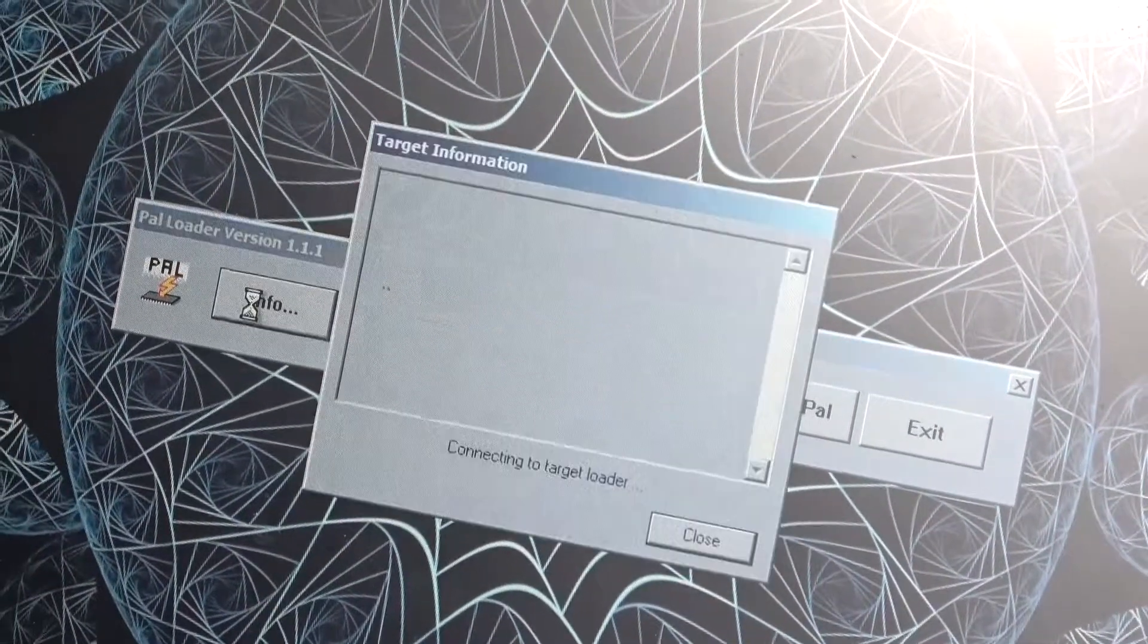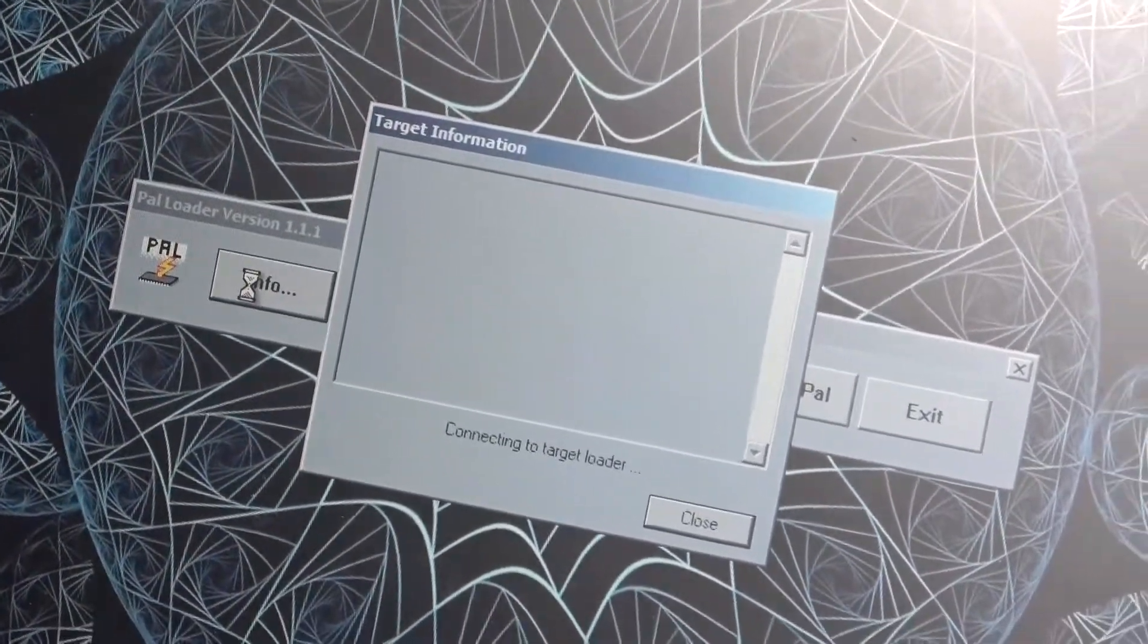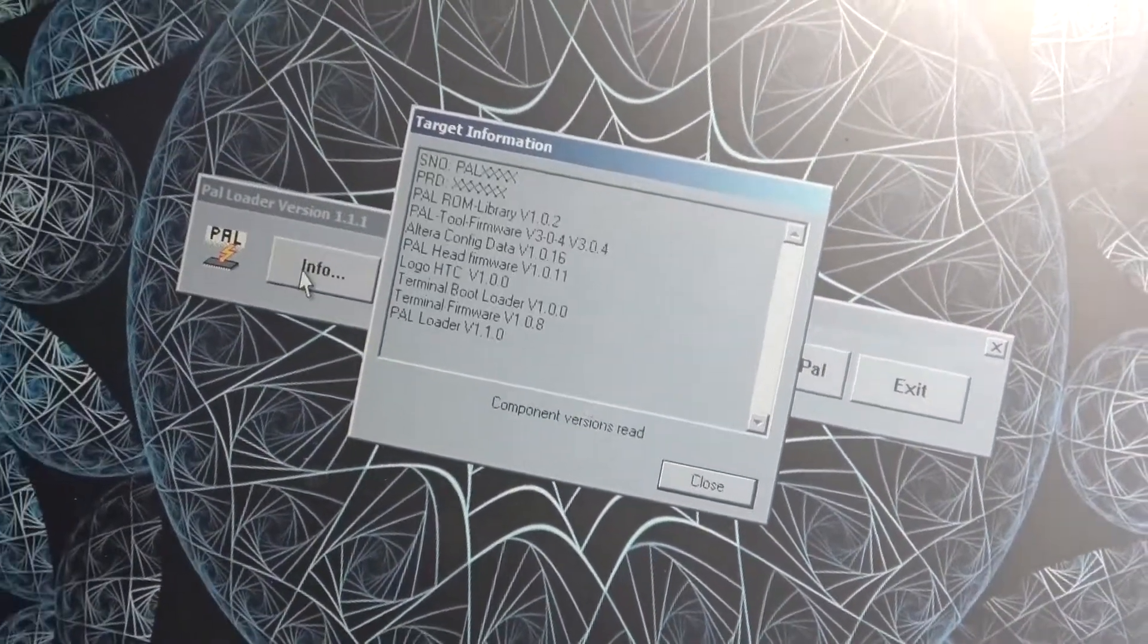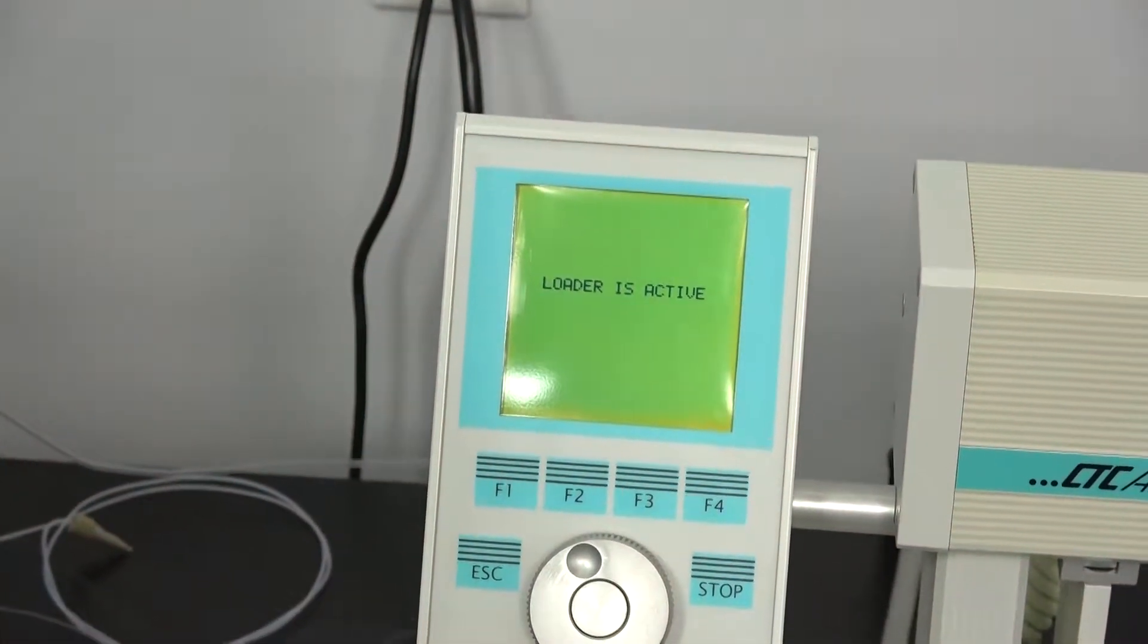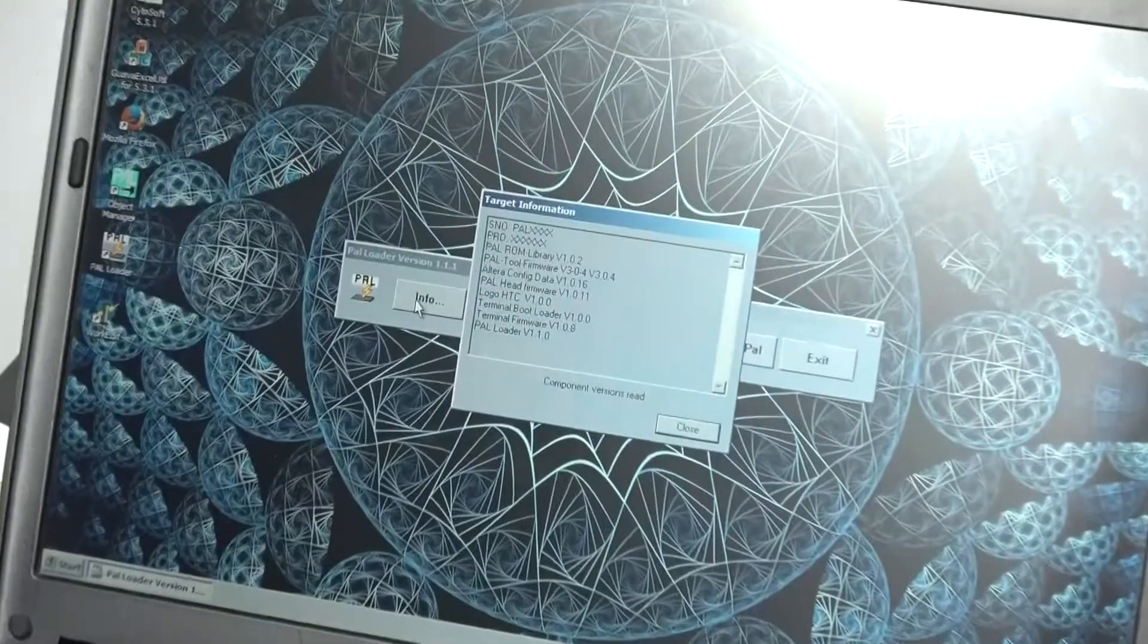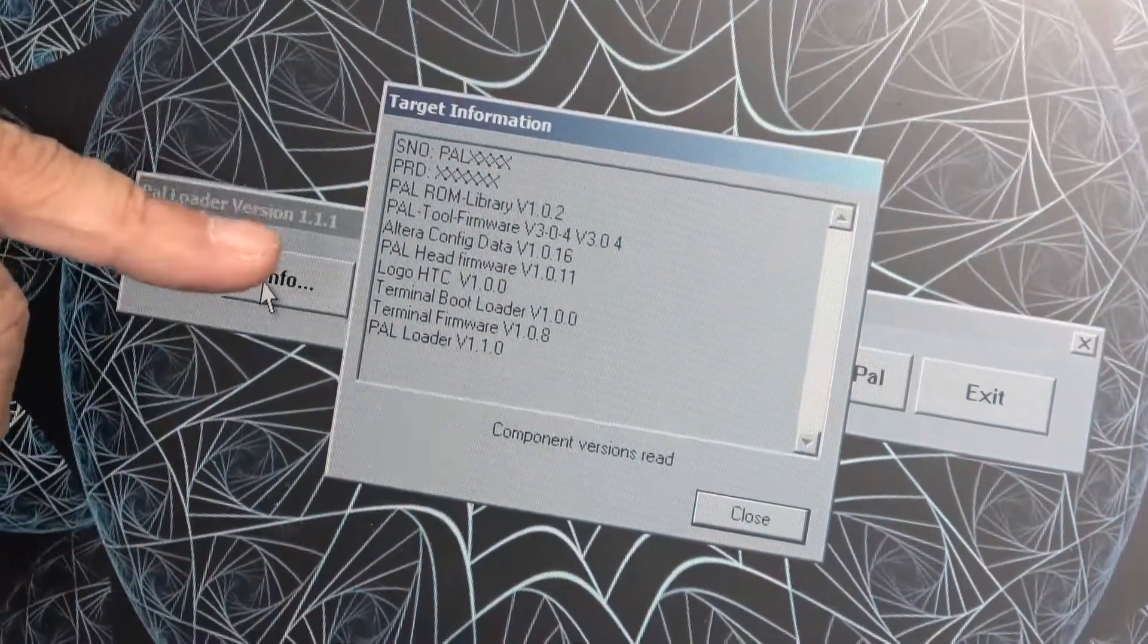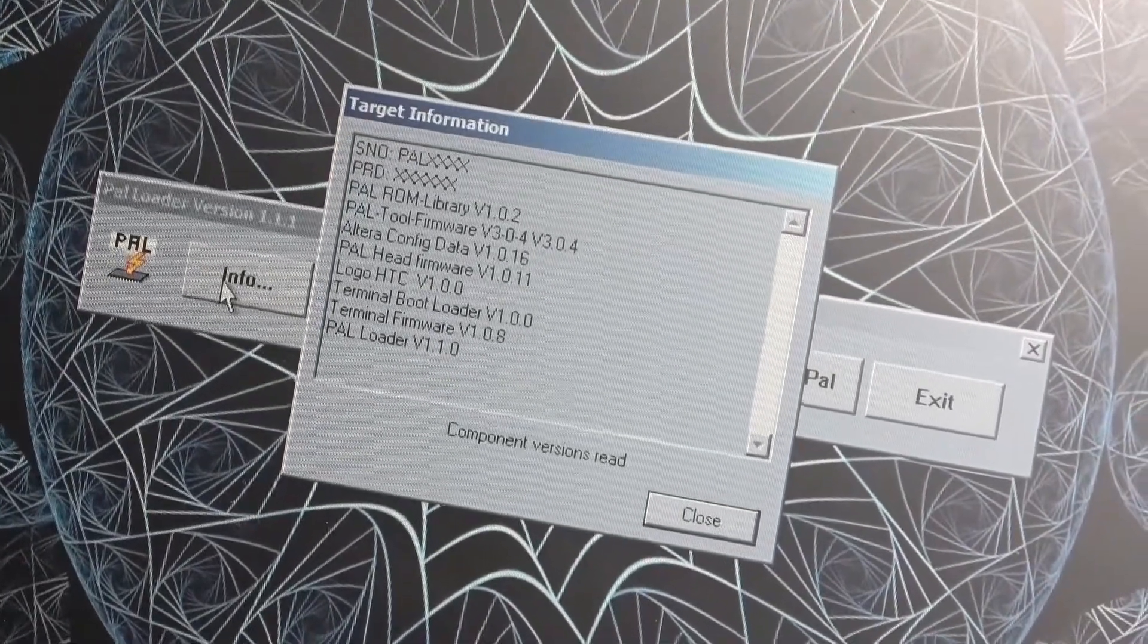You can also get info to find out what version you have. Maybe you've got software that wants a newer, better version. When it is logging in, you'll notice on the control pendant that it tells you the loader is active. So that is no longer a functioning unit while this is in the software. It gives you your serial numbers, your ROM versions, your software versions, your head numbers, all that.